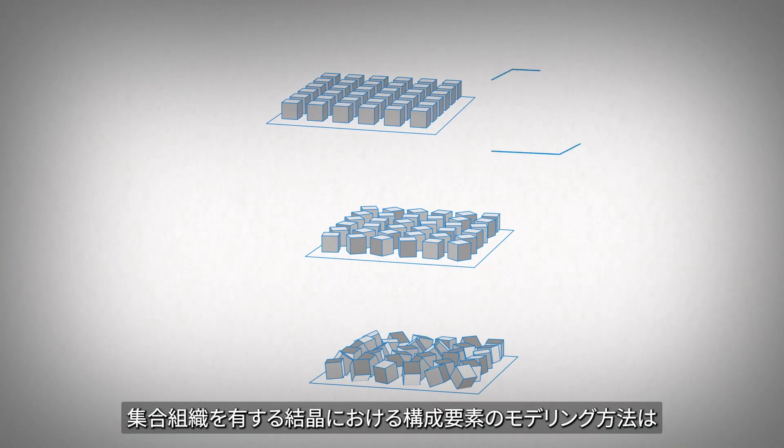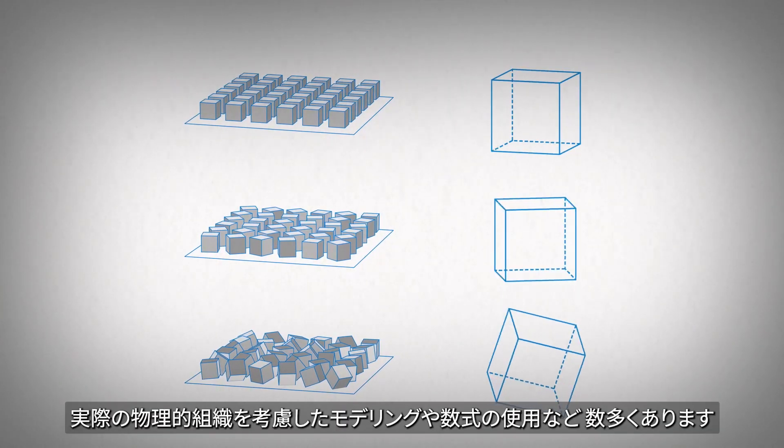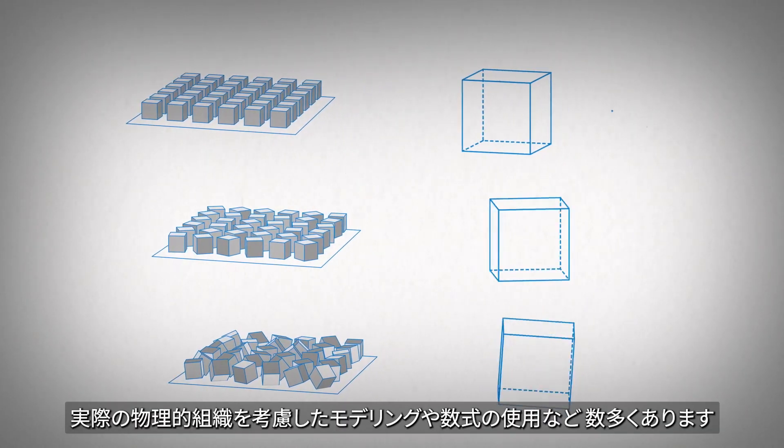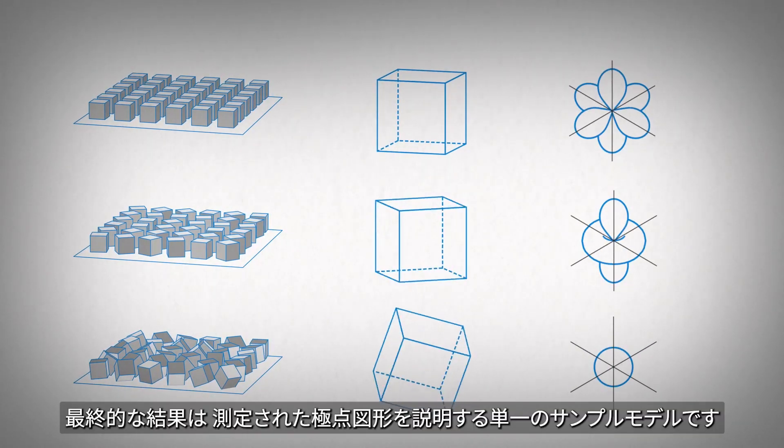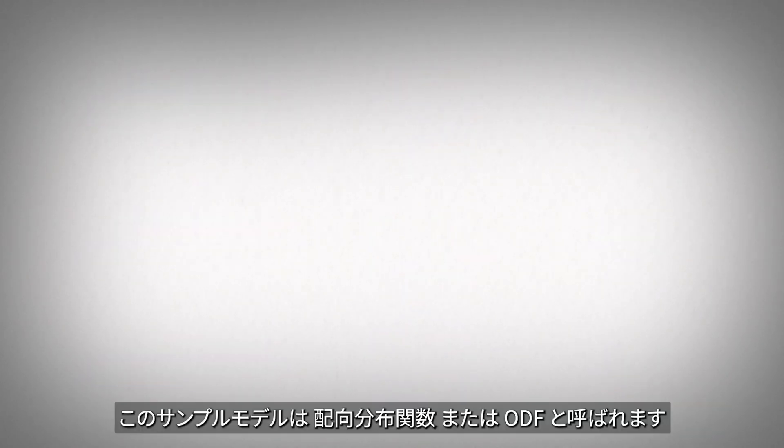There are many ways to model the crystalline components of a texture, including modeling an actual physical texture or using a series of mathematical equations. The end result is a single sample model which explains the measured pole figures. This sample model is called the orientation distribution function or ODF.